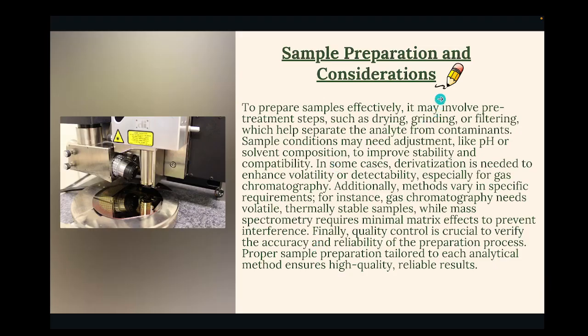So how are samples prepared in the atomic force microscope? Generally the preparation of the sample is done very carefully, because it generally takes place in a vacuum. When the sample is prepared, it is placed into the vacuum, because no impurities should be there in the sample, otherwise it will cause the tip to get destroyed, or the sample may also get destroyed. So it is generally done in a vacuum.